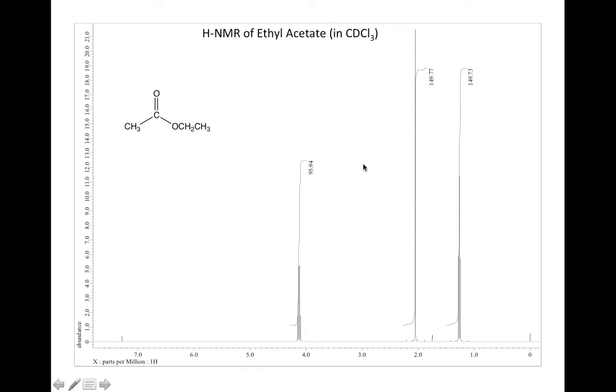Now remember, in the NMR, you don't actually know the absolute number, you just know the relative number. So if we didn't know how many total hydrogens there were or what the answer was, this could certainly also be 4 to 6 to 6. Okay, it wouldn't have to be 2 to 3 to 3. But since we're going to normally know how many protons there are total from the molecular formula, or in this case we actually have the structure, we know that it must be 2 to 3 to 3. So that's the first thing you want to do when you look at your NMR. And a lot of times I think students don't spend enough time looking at the integration because it's pretty simple and it gives you a lot of really valuable information.